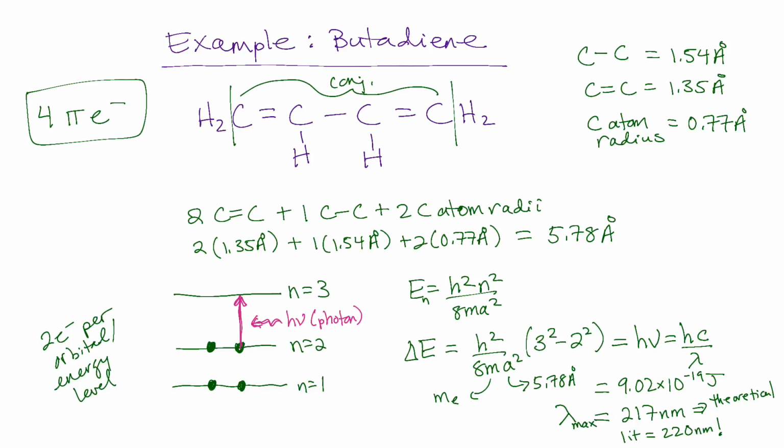Again, 3 nanometers, really good for UV vis. A difference of 3 wave numbers in an FTIR, way different. That would actually be a pretty significant uncertainty for something like an FTIR spectrum. So you really want to take into account the technique you're using, the instrumentation you're using. They're all going to have different sensitivities. So you want to keep that in mind when you start trying to label a model as quote unquote good or bad. So here, really good for UV vis.